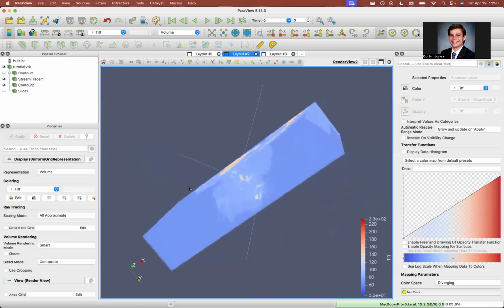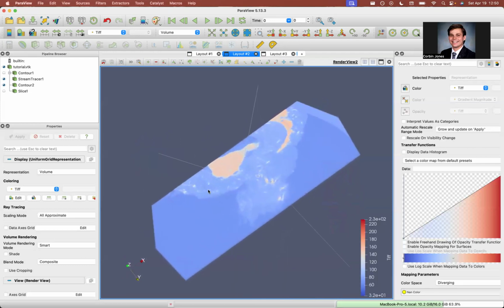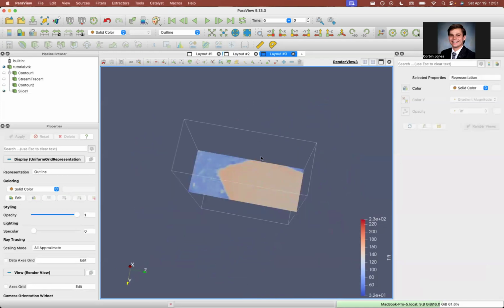So this kind of lets us illustrate the direction of these visualizations with respect to the volume and again, the TIF values here. So that kind of adds on to the already 3D visualization that we have. And then the final visualization that we have is a slice.